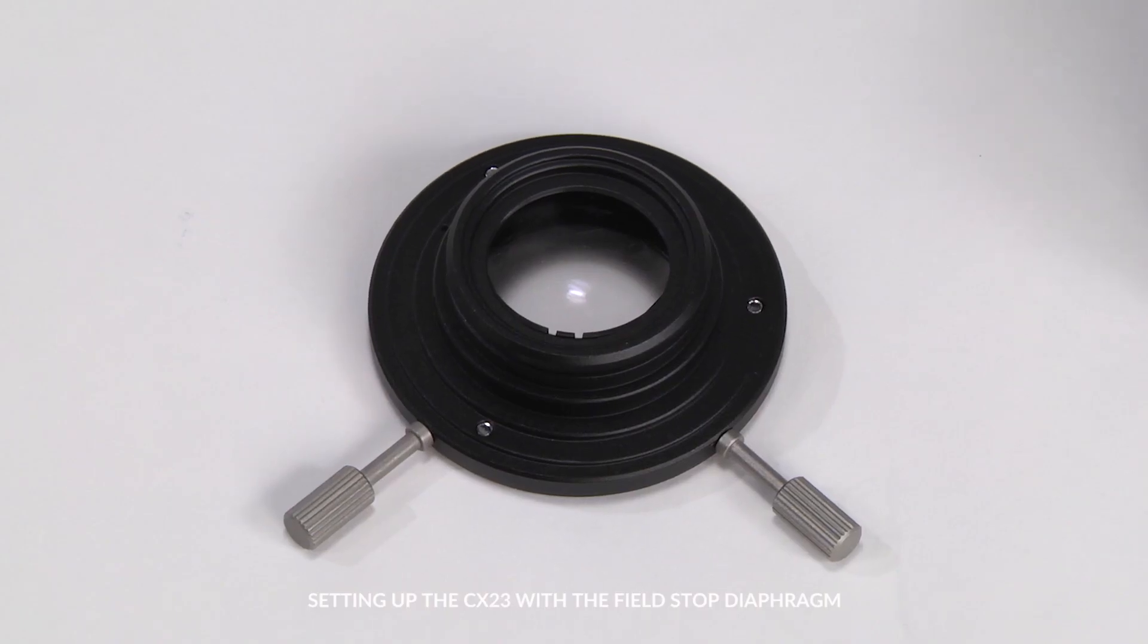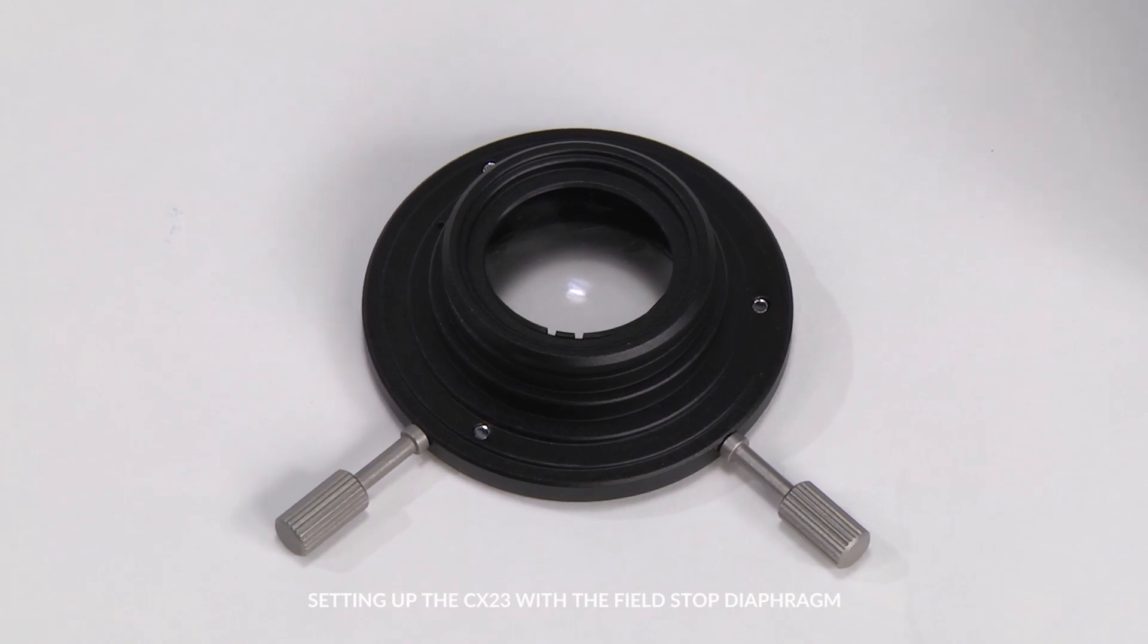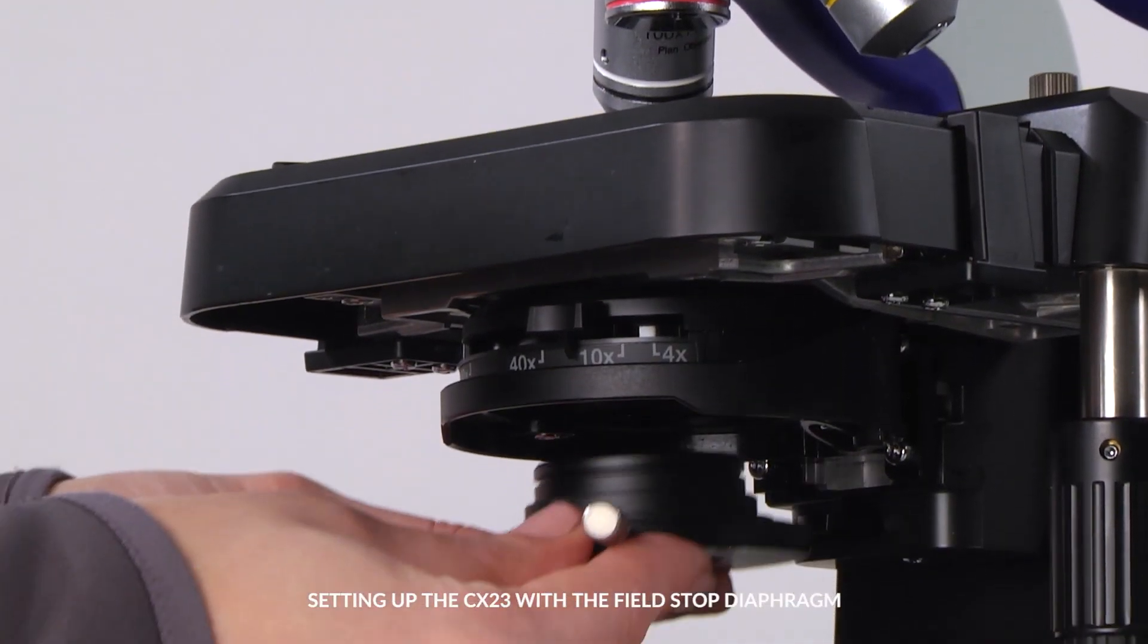Install the auxiliary lens unit onto your CX-23 microscope by placing it under the condenser and pushing it up until it clicks.